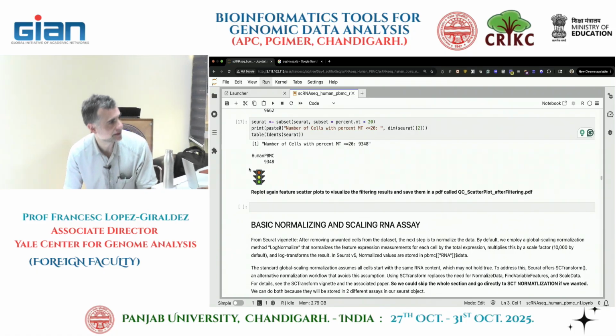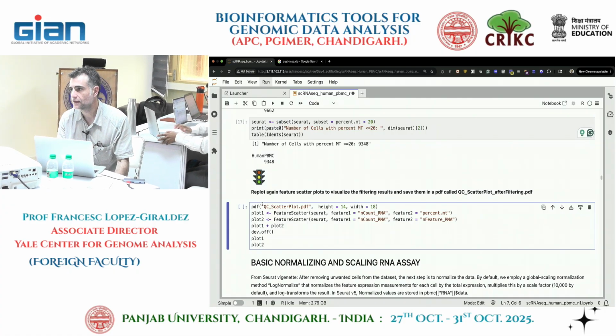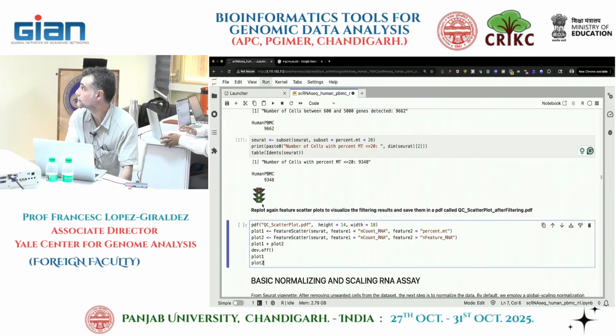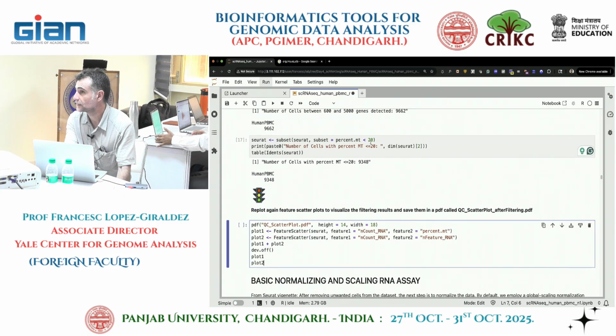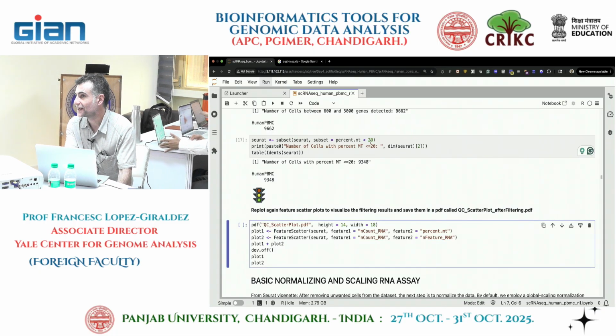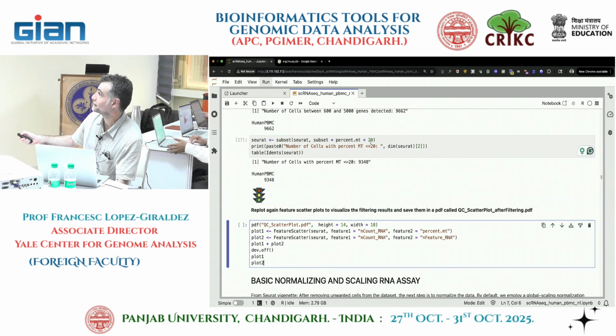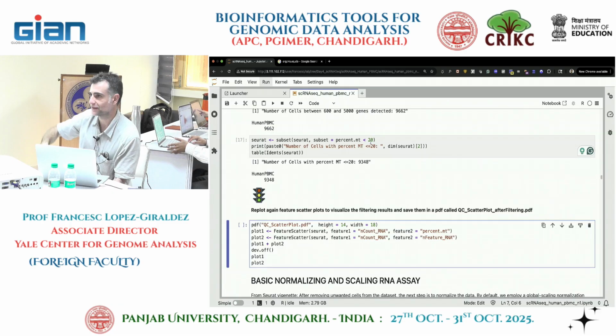So any problems with the exercise? I'm assuming no, right? I have one problem. I tried setting the filter really low, for example percentage below 1%, and I got a table with 6 entries, and then I tried adjusting it back to 5%. You cannot, sorry. If you keep filtering down, because you rewrote the object, you don't have those cells anymore. To put them back in, you're going to go up and rerun everything.